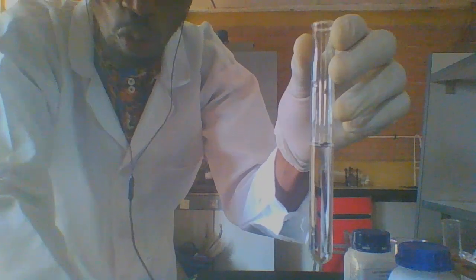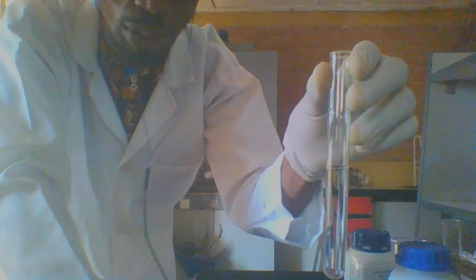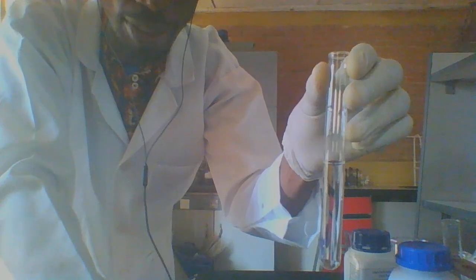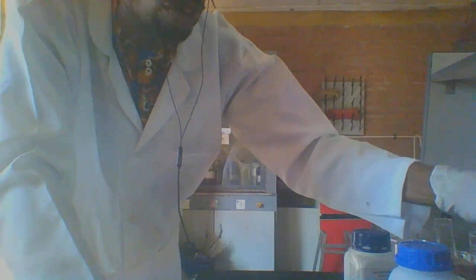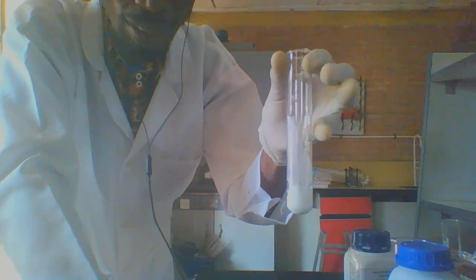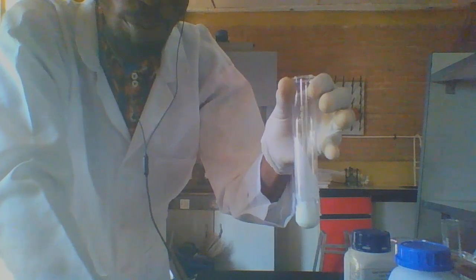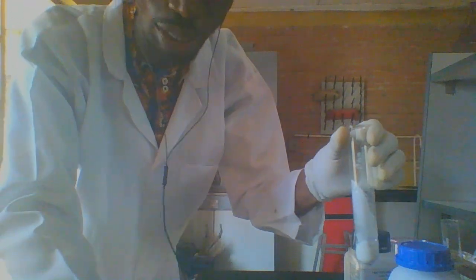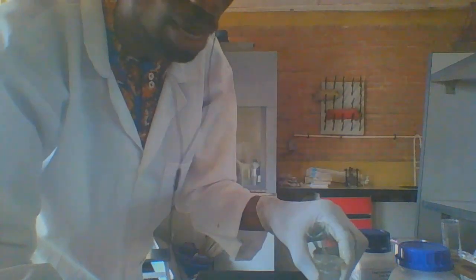Now, in an exam situation, nobody tells you when to use lime water. You should know that any gas that comes out, you have to test it, and you state the gas and the source of the gas. I have to prepare the lime water before adding the nitric acid to the mixture. Now, I'm going to add trioxonitrate(V) acid here, and this is my gas delivery tube. I've got everything ready, and I'm ready to add it.